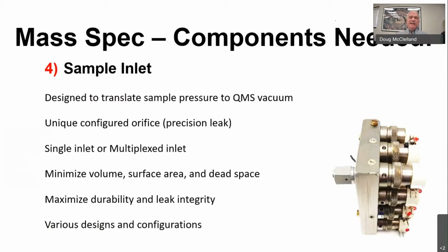And it's this inlet system where you protect yourself and give yourself the best quality of measurement. Any leaks will interfere significantly with your measurements. So you want to have a very leak-tight inlet system, and you want to have a very quick introduction of the new sample and replacement of the old sample with the new sample.